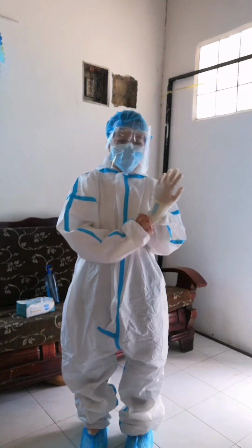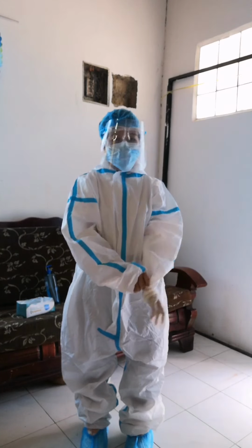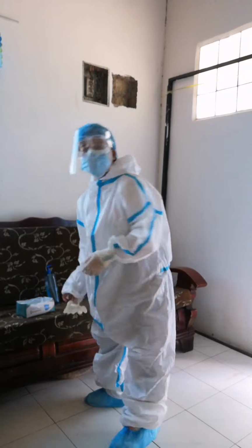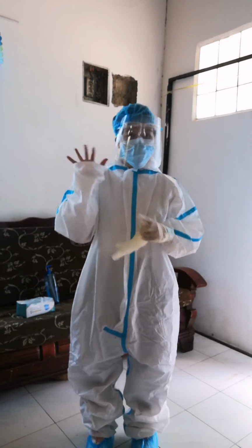Next is to don our gloves. We must extend it to cover the wrist, with two isolation gloves. This is mainly to avoid the exposure and touching of our skin, especially in this area or about the hands.